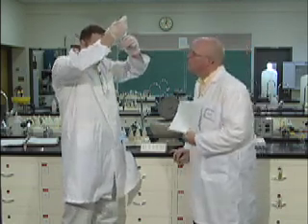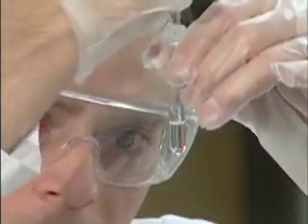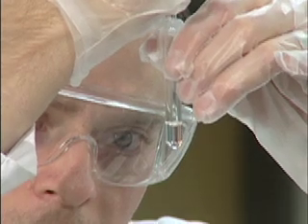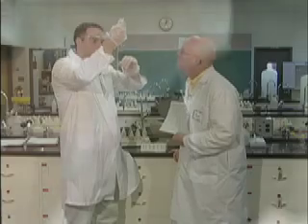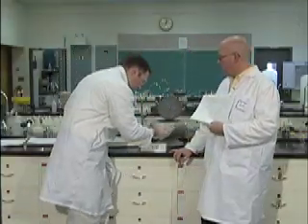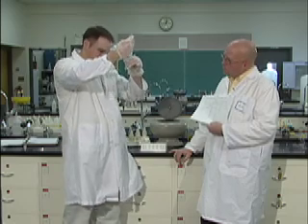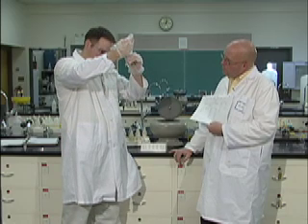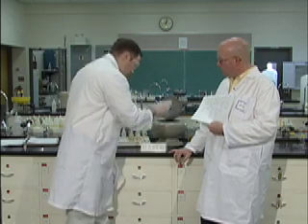Okay, so now we have... Oh, that's tough to see, eh? Yeah, it is a little tough to see sometimes. If you're having trouble seeing these, you can always just take more and use more in your solution. We're going to decant off most of the liquid here, but we're going to leave a little bit because the iron in the bottom is a jelly-like precipitate and it will come up the tube.